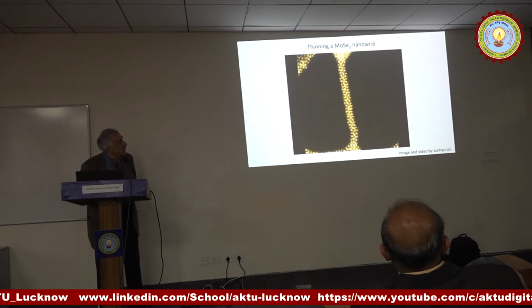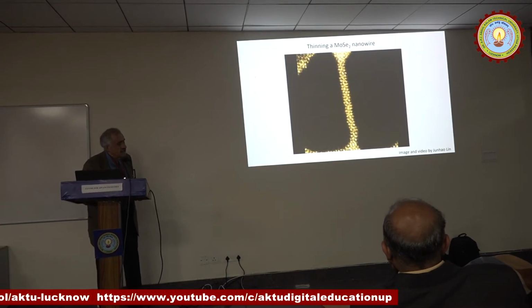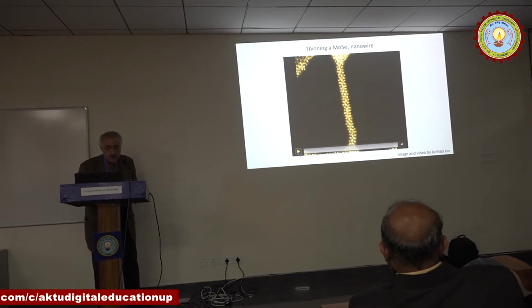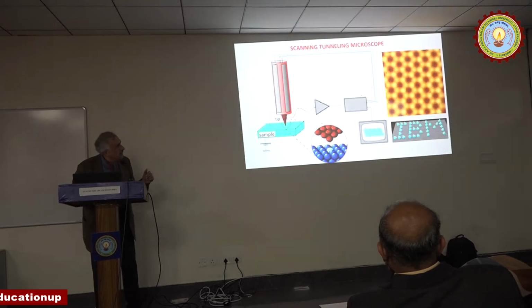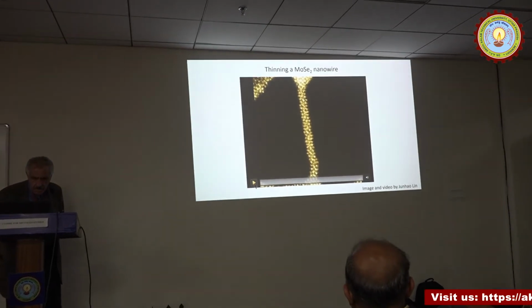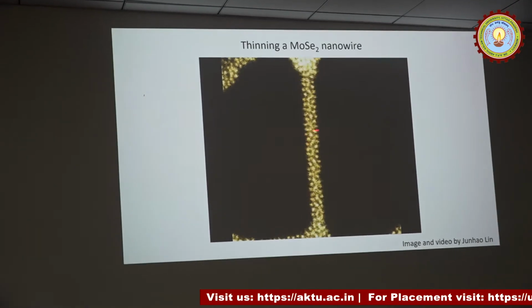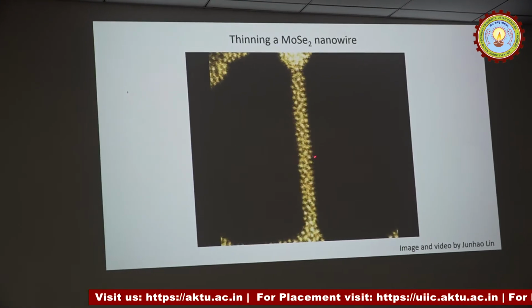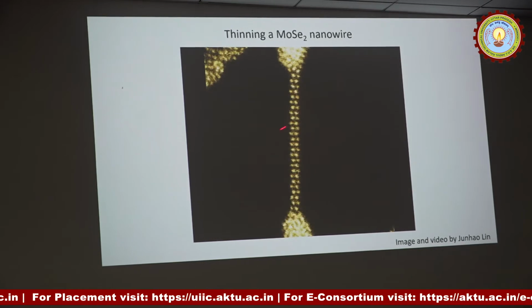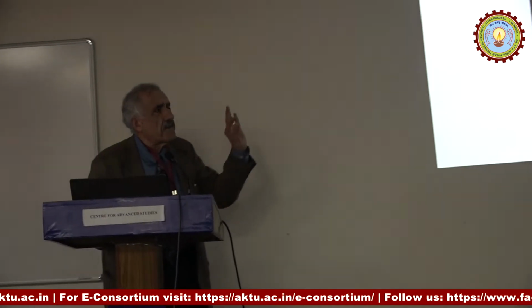This was MoS2, and we changed the color here on purpose. This is molybdenum diselenide. It's a more beautiful video that I want to show you. So you see how reasonably fat the wire is. It's several atoms thick. And watch carefully what's going to happen, and see how it gets knocked about by the electron beam. And now look, it peels off, and look how it gets kicked, and it does not break. These are 3 atoms thick.